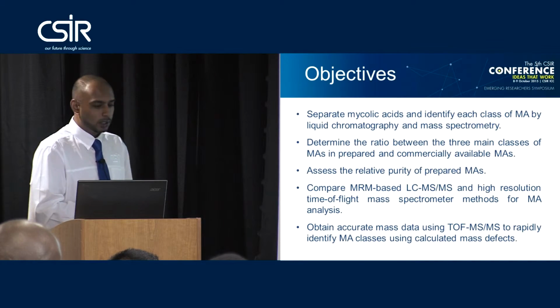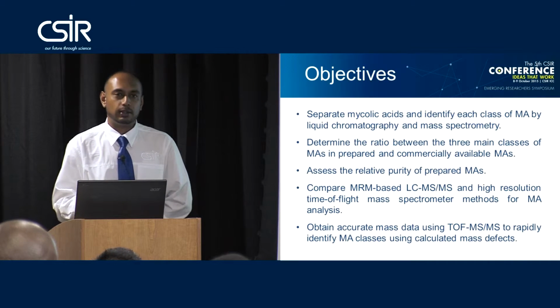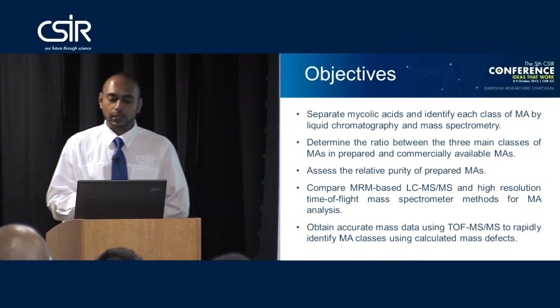Another objective was to compare a triple quadrupole mass spectrometer to a time-of-flight mass spectrometer. So essentially there we're comparing nominal mass acquired data to accurate mass acquired data.